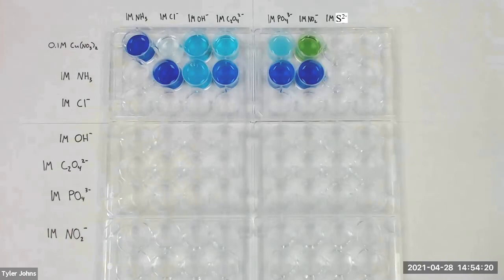We will next add one milliliter of one molar chloride ion, mix, and note any changes that occur.